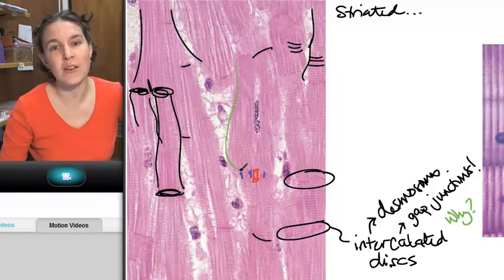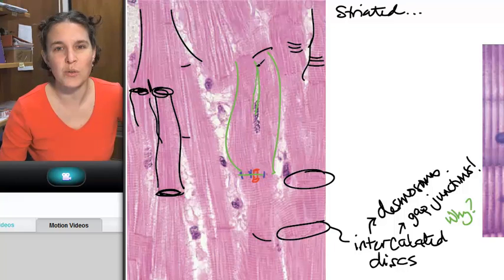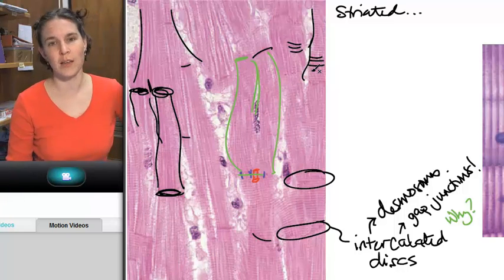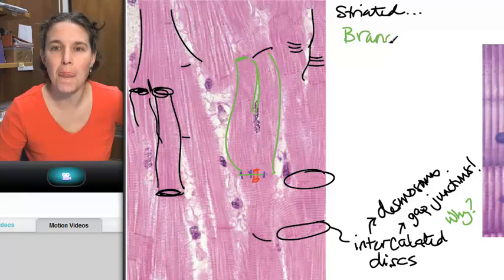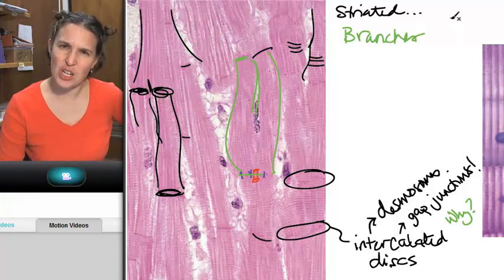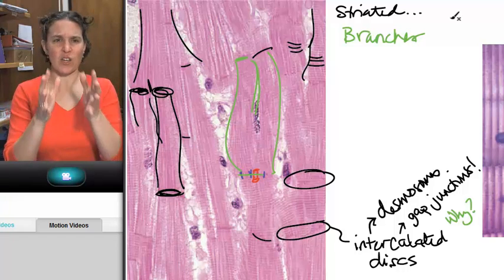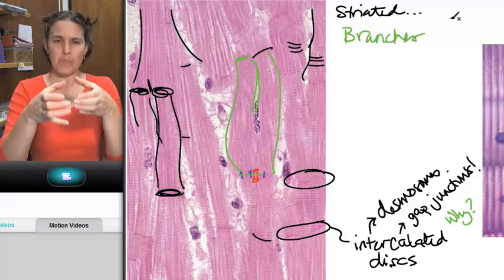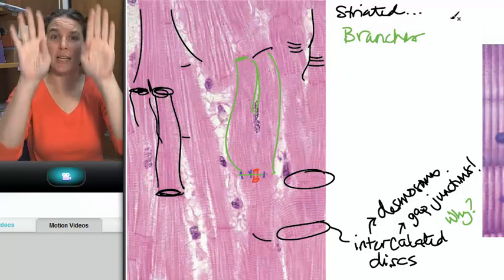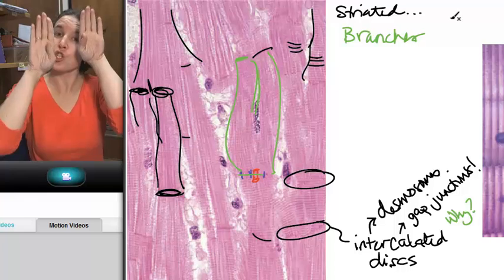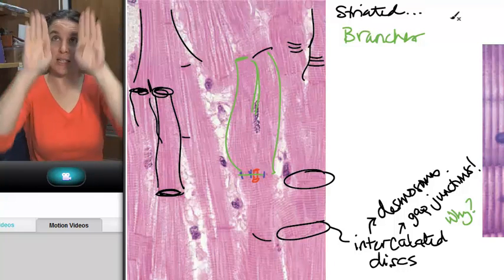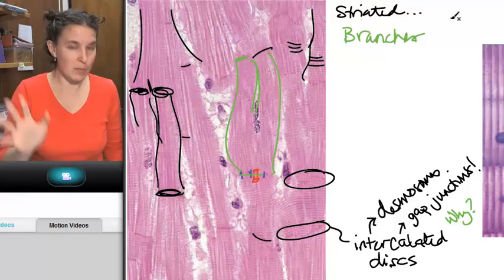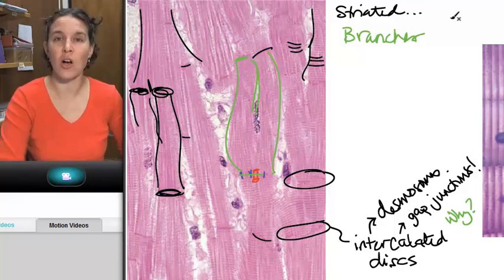Here's another characteristic that's related. What did this cell just do? Dude, really? It branched. Cardiac muscle tissue branches. The cells branch. And they literally, okay, so here comes along a tubular cell and then it branches, and it has two connectors, not just one. It forms two connections with another cell at two intercalated discs. And they do that all over the place. They branch and connect all over the place. Why?